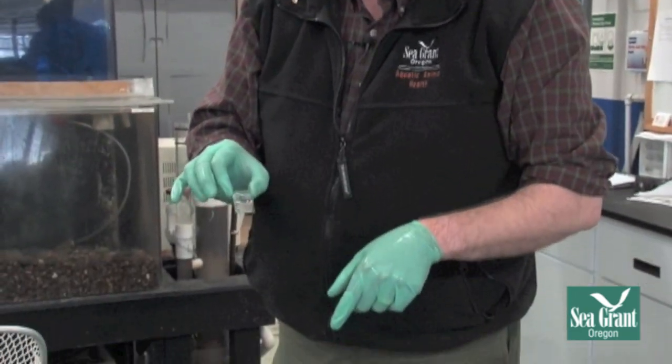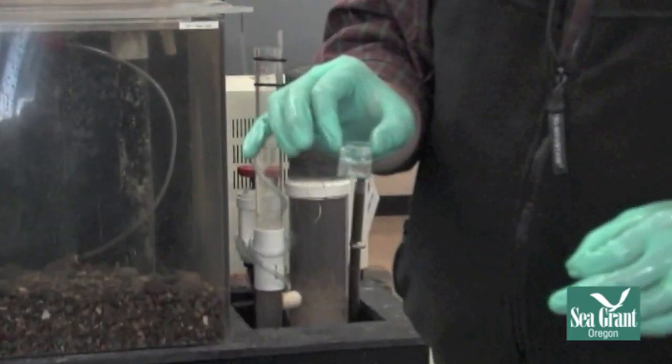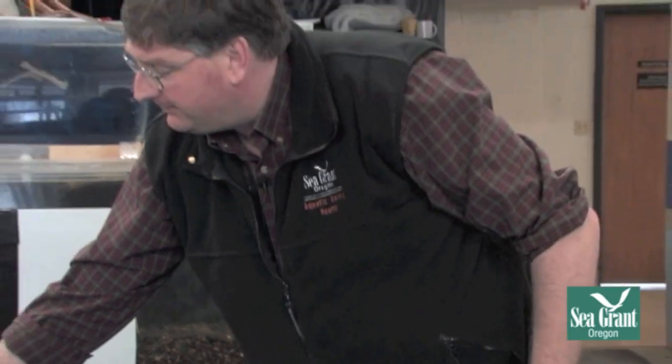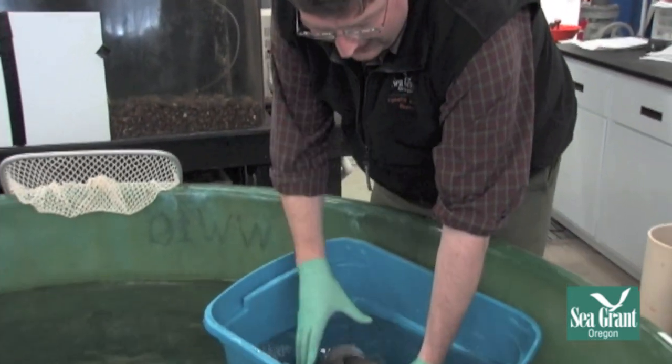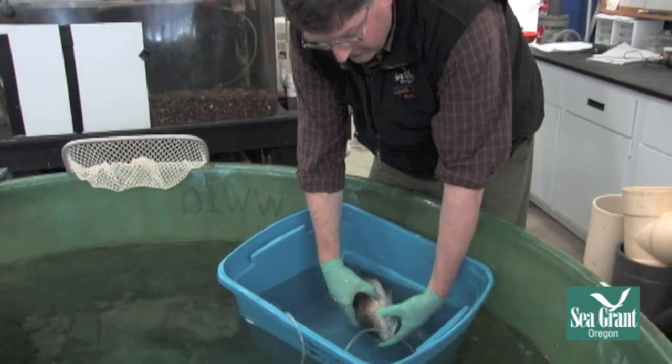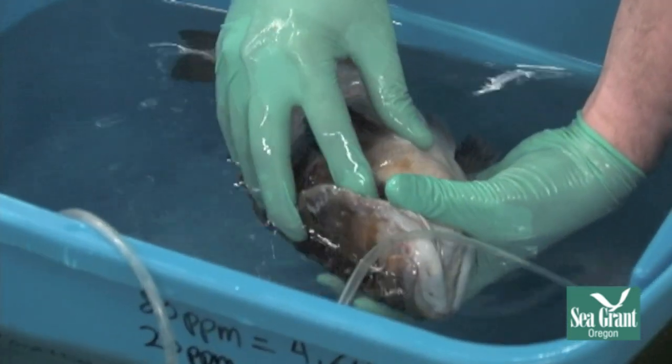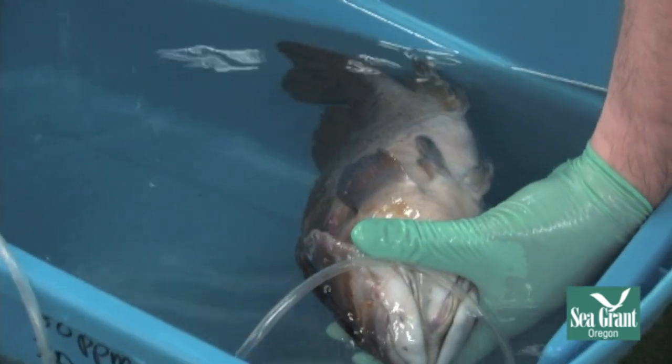This also allows you to evaluate the gill architecture and any changes that are going on in the gill. That little piece is not going to hurt the fish at all. The fish blood clots very quickly, so it will be very easy for the fish to recover, and that will grow back. If there's any bleeding, you can just take your finger and use direct pressure on the gill where you're seeing the bleeding, just like you would on yourself.